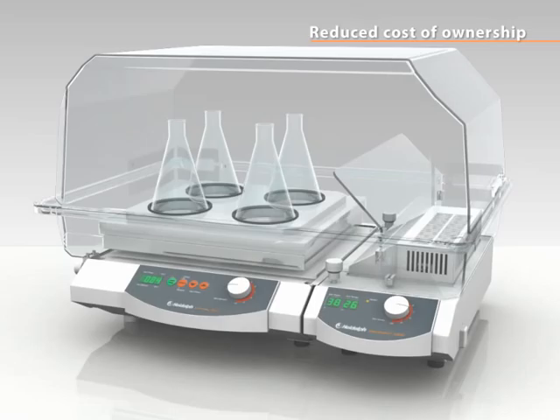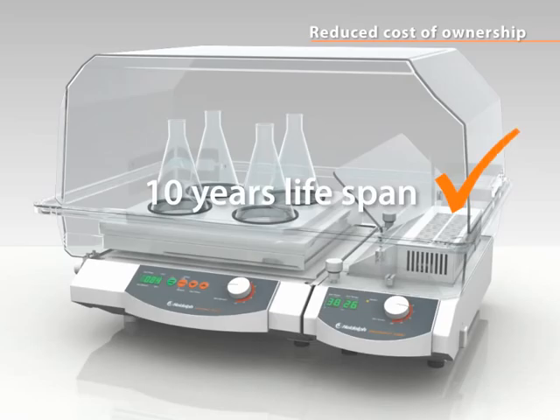The sealed housing protects your shaker from aggressive fumes, liquids and vapours to prevent internal corrosion. This results in an increased lifespan of ten years on average at reduced maintenance and repair costs.